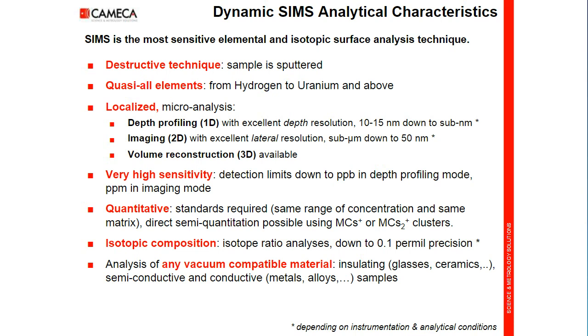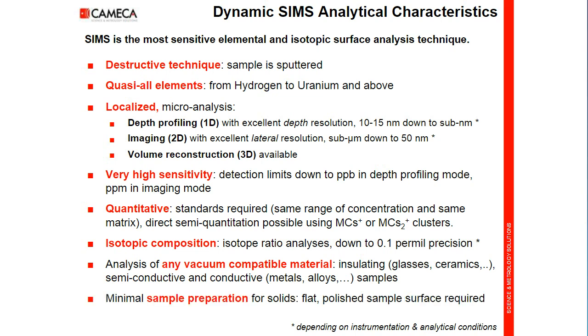Sample preparation for dynamic SIMS is crucial for obtaining reliable results, but fortunately it tends to be relatively simple. For solid materials, SIMS requires a flat, polished sample surface.